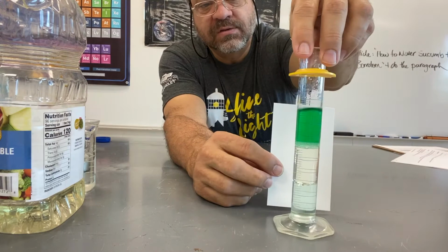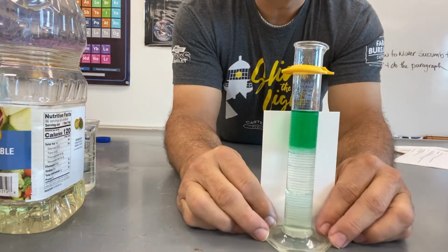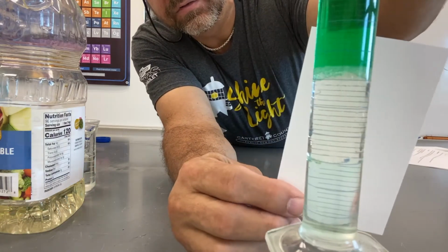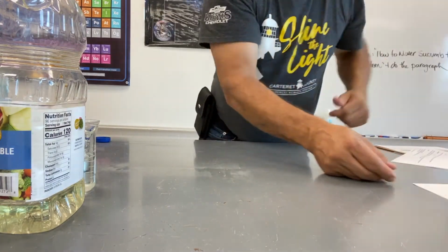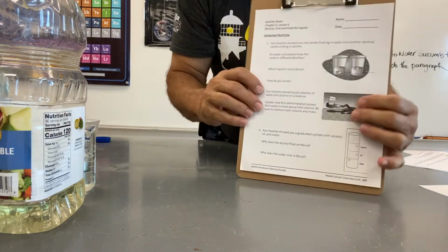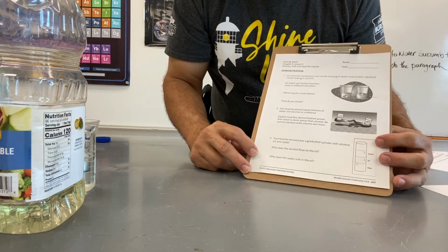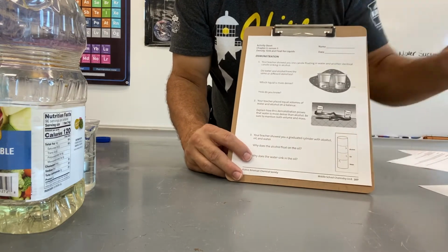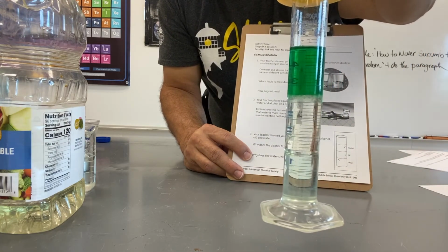So think about why that might be. Let me turn this a little bit so that the measurements are not obscured or showing up in the camera as much. Why do you think we might be getting that kind of layering? All right, so on our sheet, now we're at the bottom of our activity sheet answering these questions here. The teacher showed you a graduated cylinder with alcohol, oil, and water. Why does the alcohol float on the oil? Why does the water sink below the oil? So again, that's what we're seeing here. The alcohol is green, it's on top, the oil is in the middle, and the water is at the bottom.